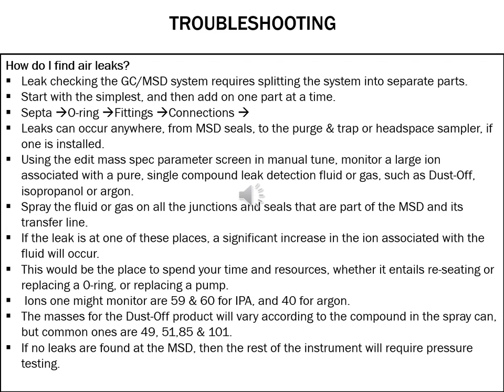And then if you've checked and you still can't find the air leak, it might be because the transfer line ferrule is cracked and needs to be replaced. Or you might find that there's a leak coming from your MSD on the side, the O-ring on the side of the MSD needs to be replaced, or maybe your vent valve is open, or the O-ring on the vent valve needs to be replaced. So yeah, you can go through all the slides, and they're self-explanatory.